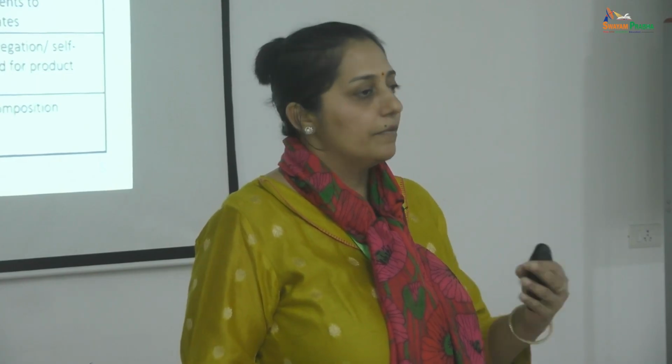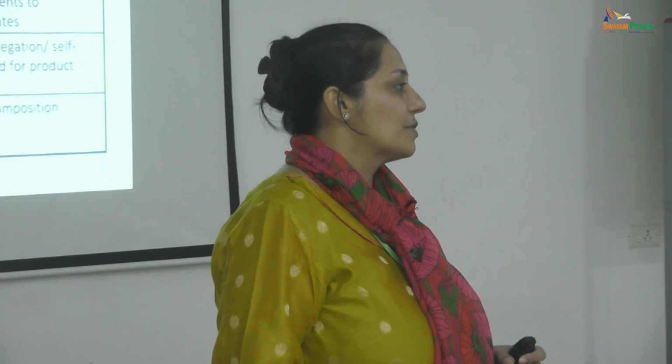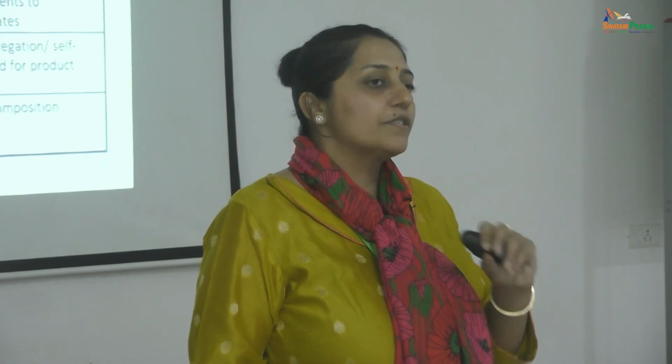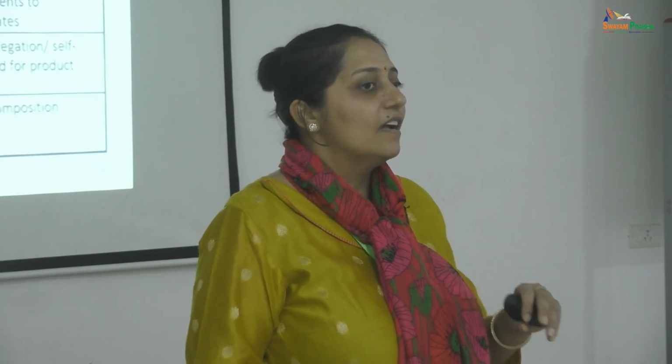Now, if we use Rushton turbine type impellers with plant cell cultivations, you may end up with cell viability loss because of the high shear forces generated. So your biomass concentrations may not match what you had seen in the shake flask. Generally, in microbial cell fermentations, when you do it in the reactors, the concentrations do improve.